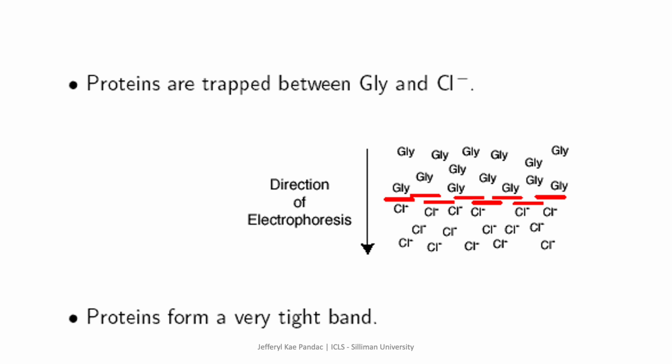An area of unbalanced positive counter ions is developed, thereby developing a steep voltage gradient between the chloride ions and glycine molecules. Between the slow-moving glycine molecules and the fast-moving chloride ions are the proteins from the mixture. Being intermediate in their mobility between chloride and glycine, the sample proteins are carried along, becoming stacked into very thin, distinct layers in order of electrophoretic mobility.